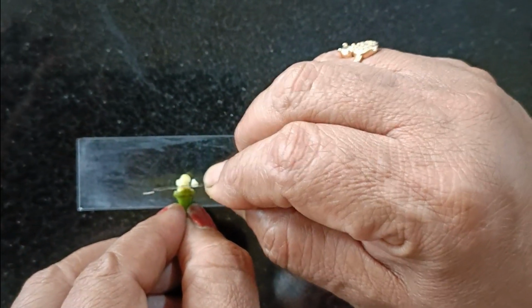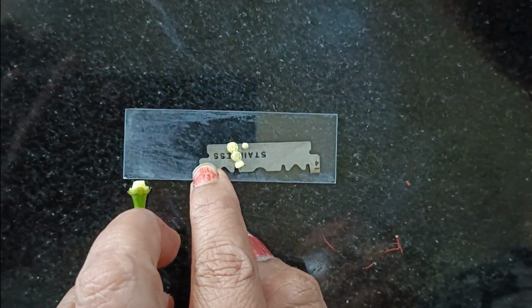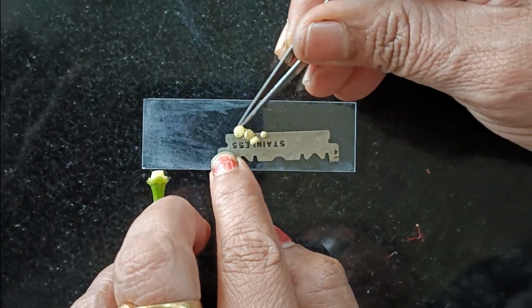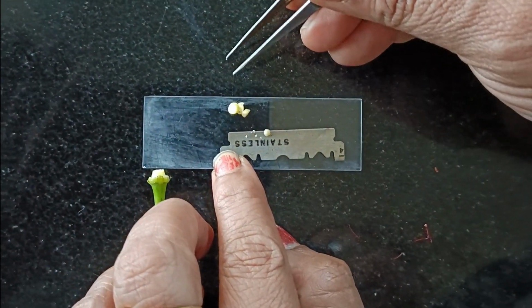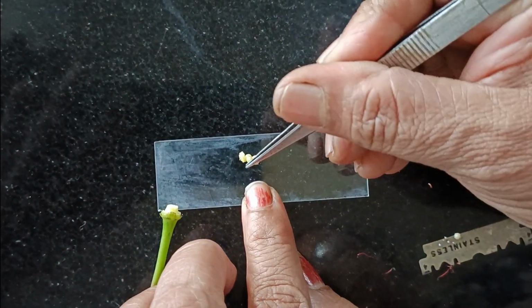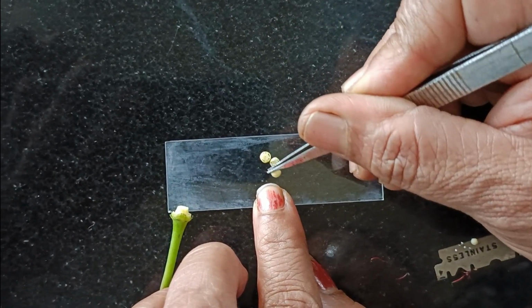Ovary, in botany, is an enlarged basal section of the pistil, the female organ of the flower. It contains ovules which develop into seeds upon fertilization. Ovules also house the egg cells. Ovary will mature into a fruit, either itself dry or fleshy, enclosing the seeds.